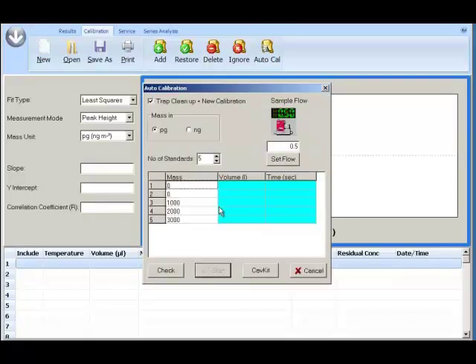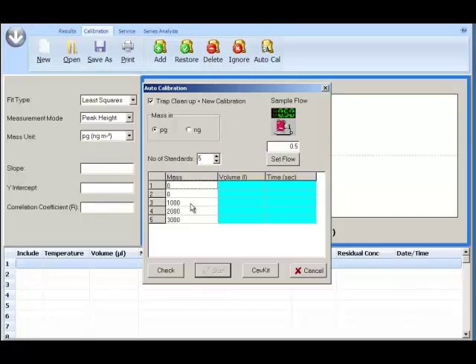Then it opens the Auto Calibration dialog. Tick Trap Cleanup and New Calibration. Select the units. Enter number of standards.